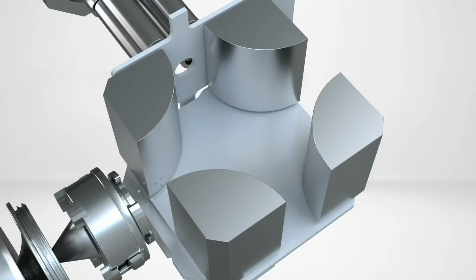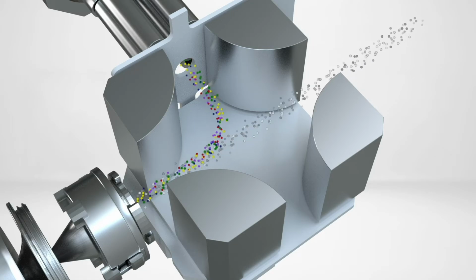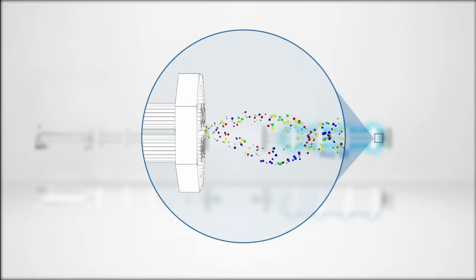Sort of purity levels. And not only are we looking at the impurities that are homogeneous within these materials, sometimes there's the random impurities which are very transient. And so we're also looking at single particle metallic contamination as well with our ICP-MS. So, okay. Nanoscale. Okay, I see.